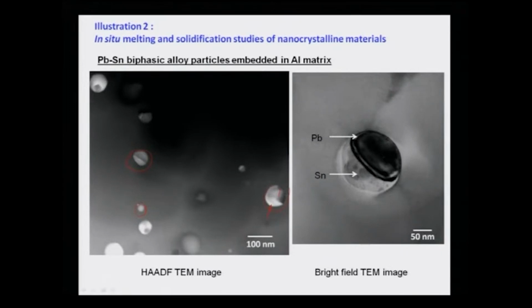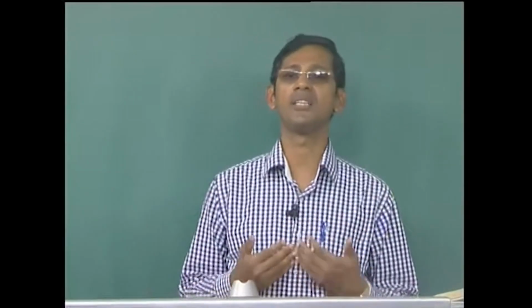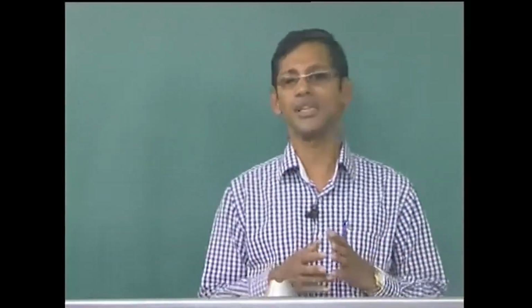If the specimen is very sensitive to the electron beam, one should not use STEM in a FEG microscope; rather one should use a LaB6 filament, where the intensity of the electron beam is normally low. So, basically the use of STEM depends on the particular type of material. If the material is good and stable, you can go ahead with the normal FEG microscope, STEM configuration and obtain all kinds of information. If the material is beam sensitive, you cannot do it, so you have to change to the normal microscope.